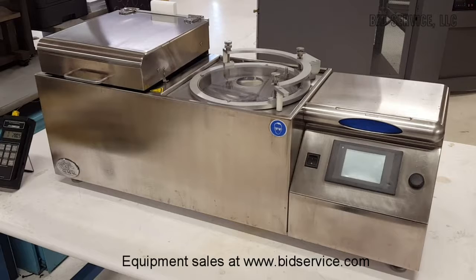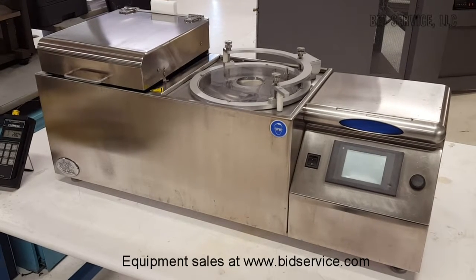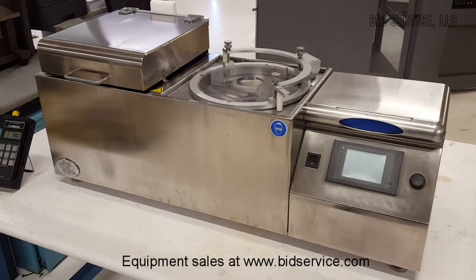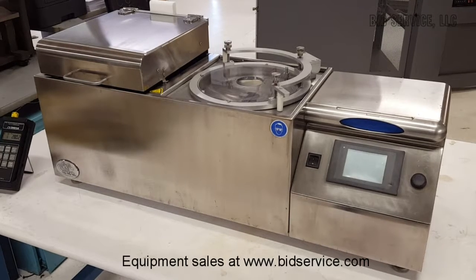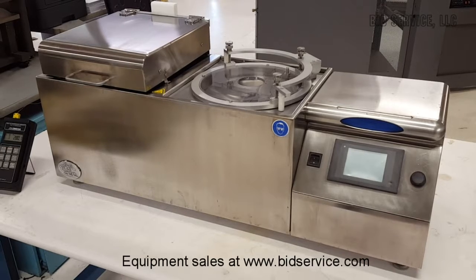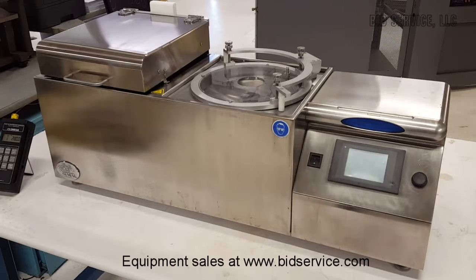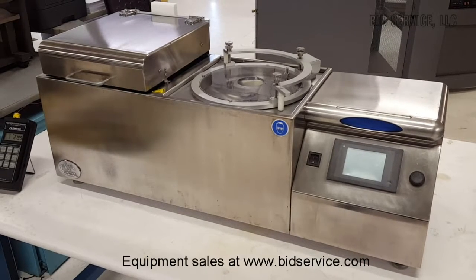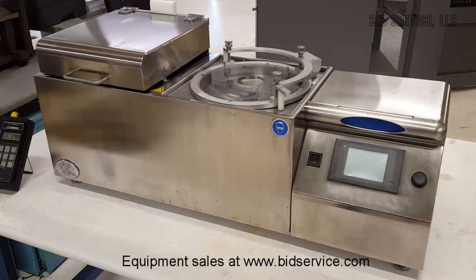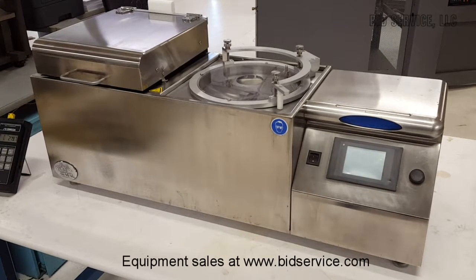This is a demonstration of the C-200CB. The C-200CB is a programmable coder-baked plate combination from cost-effective equipment. It features auto-tuning PID and digital control and a resilient quarter VGA touchscreen, offering an easy programming interface with graphic monitoring capabilities. The C-200CB is a robust and high-performance spin coder-baked plate system capable of providing production performance in a small benchtop package.